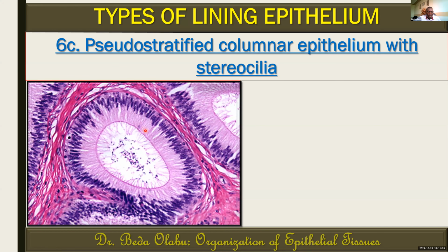And this one is so classical. We see several nuclei at the basal zones, but we see hardly any nucleus on the apical zone. That is how pseudostratified epithelia look. So I've used this to help you understand how to pick pseudostratification on light microscopy.